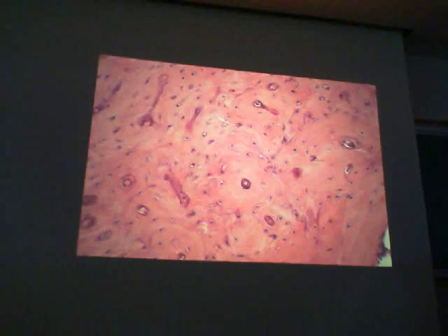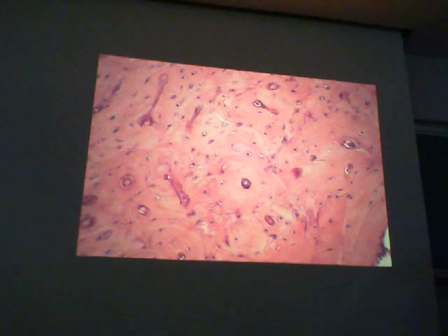In fact, there is a megakaryocyte, looks like, right there. How do I know? I've been doing this for about 40 years. Okay, how about that right there? Volkmann's canal. Yeah, Volkmann's canal going from Haversian canal to Haversian canal. There's a little short portion of one right there. And how about this thing you see right there? What is that? Cementing line. So there's an osteon, there's an osteon. What is this right in here? Interstitial lamellae.